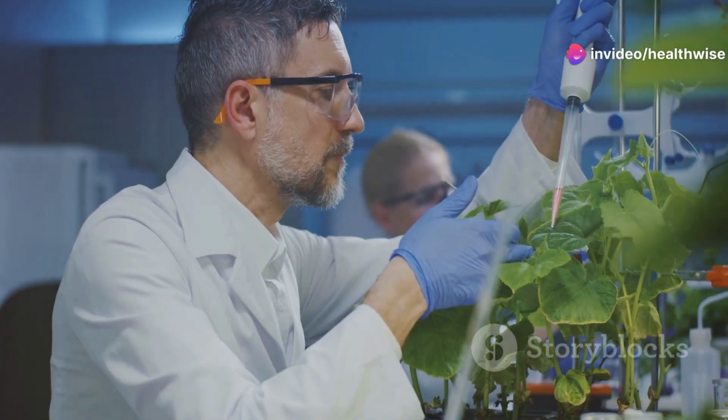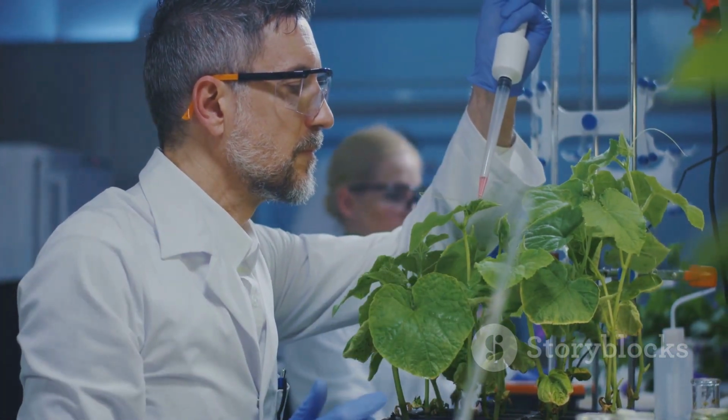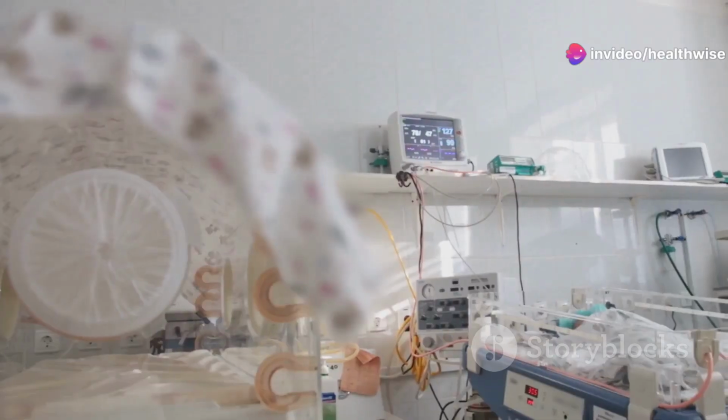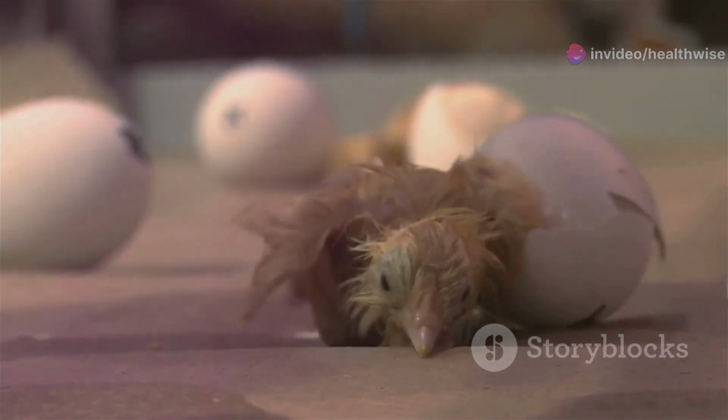To maintain a stable environment, incubators control temperature, humidity, and gas concentration. Inside an incubator, heating elements and sensors work together to keep the conditions optimal. These elements ensure that the temperature remains constant, even when the external environment changes.